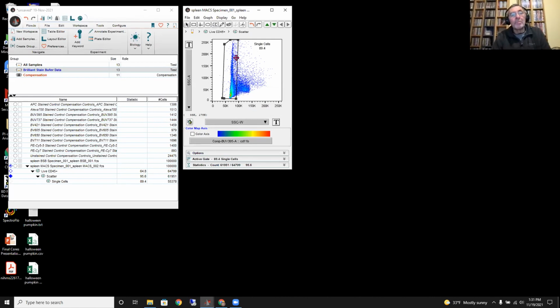Okay. And why have you chosen that particular combination of markers to pick out the doublets? Sure. So essentially what I typically tend to do is I usually like looking at every combination of the data. So I'll look at forward scatter height, forward scatter area, forward scatter width, and I look to see where I get the best resolution of my populations. There's no one defined way to say it needs to be this way, it needs to be the other way, or you need to look at a specific combination. In looking at this data earlier, I like the way this resolves our single cells.